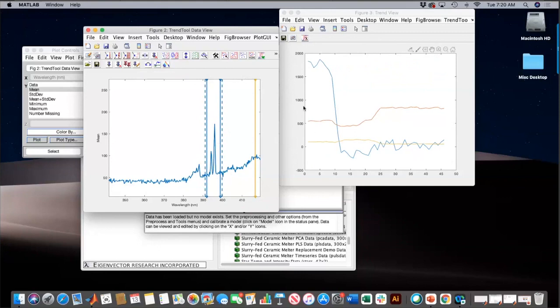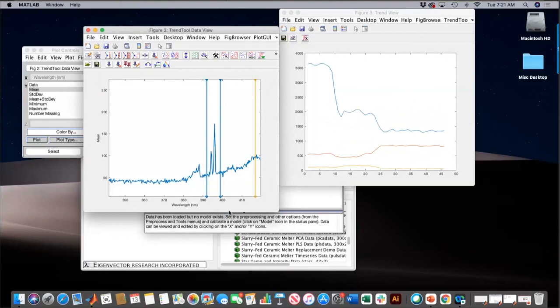Now when I look at it, I can see that it goes high when the aluminum's first coming off, and as soon as the aluminum's done, it's pretty much near zero. It is kind of noisy still, but I think you get the drift of what I'm trying to do here. There are a couple of ways to change this. You can instead do it to the maximum at that feature, or you can normalize this, lots of things to do. I'm going to remove the reference for now and tune this up a little bit.